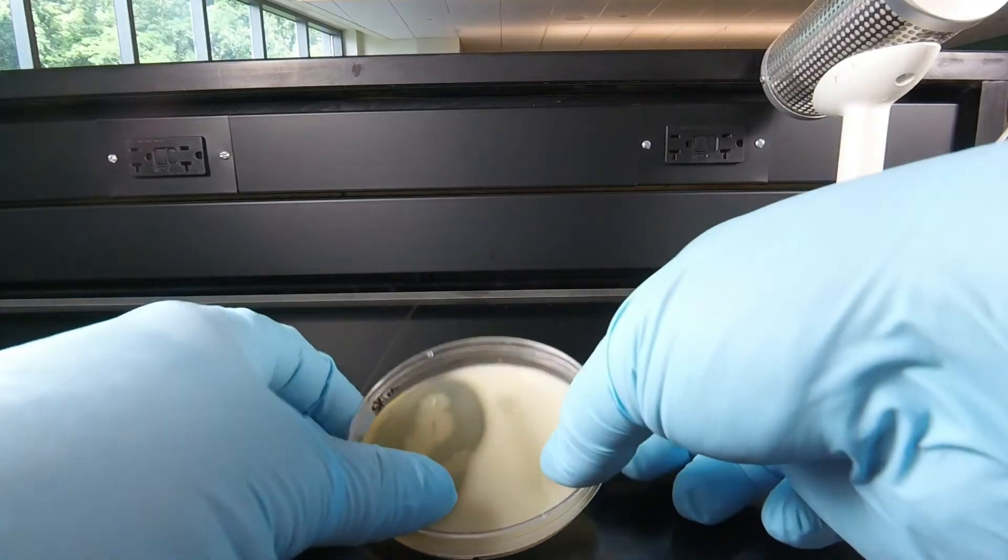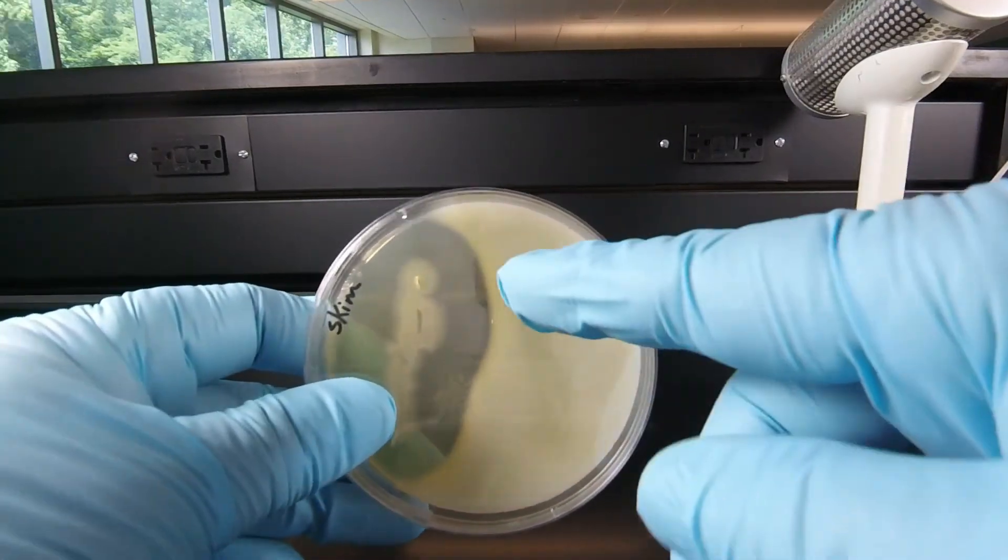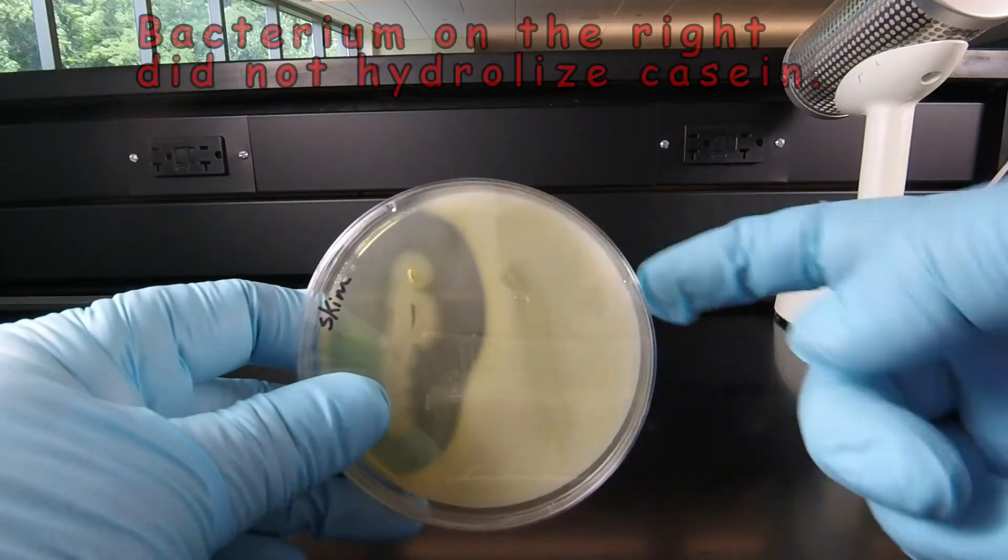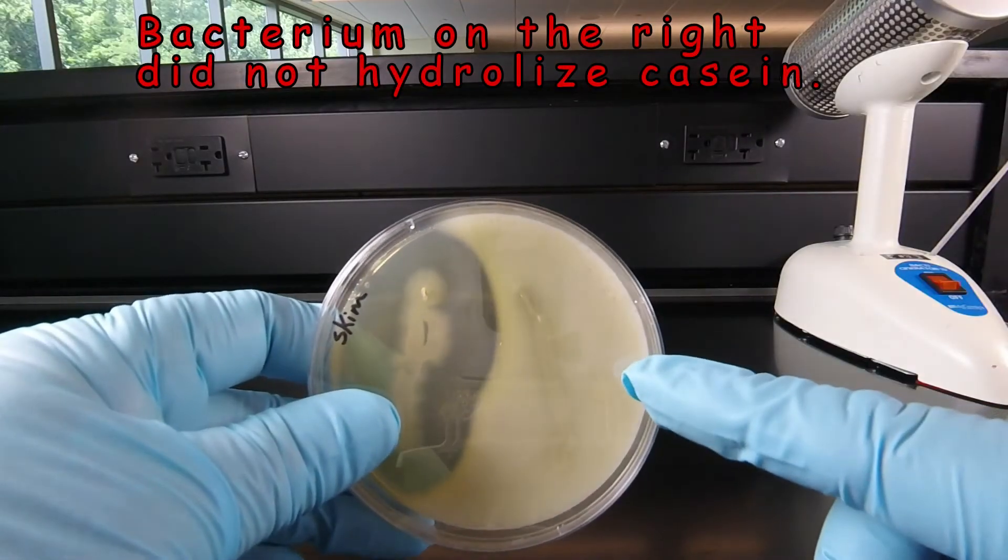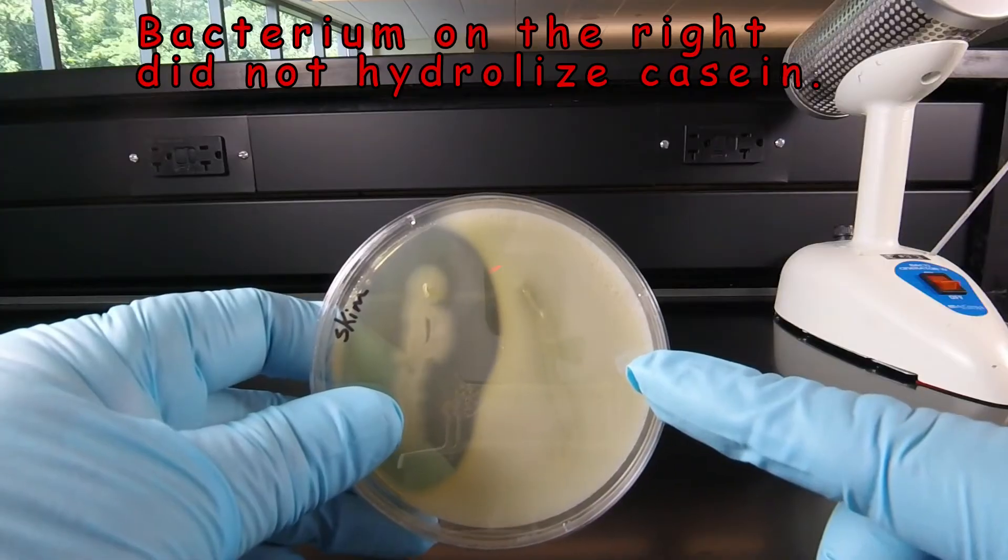We can see that the organism on the right did not hydrolyze casein. The agar still looks white and opaque, telling us the casein is still present.